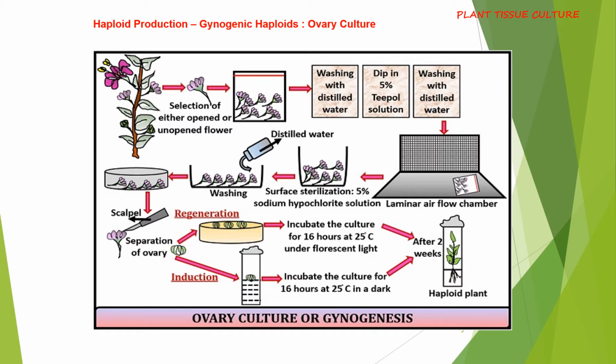These are done under a sterilized environment. The ovary is then inoculated into the nutrient media for regeneration. The composition and incubation conditions vary from plant to plant and need to be standardized and optimized.